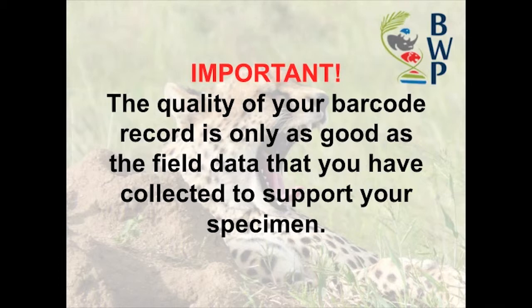Before we walk through the actual spreadsheet, let's discuss a couple of points. As highlighted here, the most important take-home message of this video is that the quality of your barcode sequence record is only as good as the field data that you have collected to support it, meaning that without exceptional field records, your sequence data will be unusable as a BWP Silver Standard barcode record. And remember, Silver is the lowest standard that the BWP will accept. If you are unfamiliar with these BWP barcode standards or need a refresher, please refer to the consultation video.